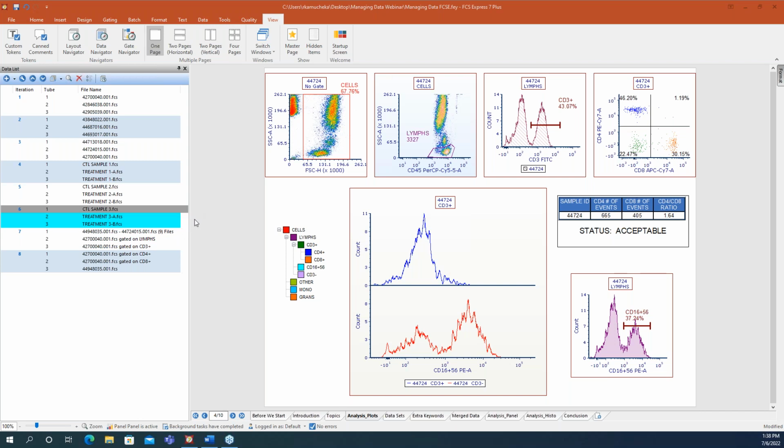And then I'm going to move back into our data files here. I'm going to ask a question so that I can make this a little more user-friendly for you and see if there's any information you want a little more on. Is there anything with your data files, either bringing into FCS Express or working with them, that you would like some help with? Is there something that's getting you stuck in your analysis? If you have a pain point or any questions, please feel free to put them in the questions window for us.